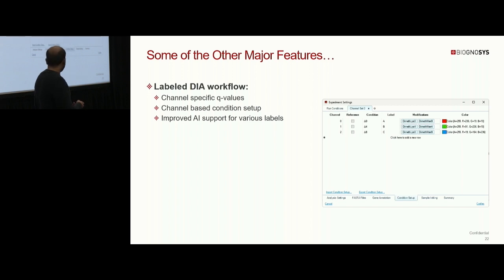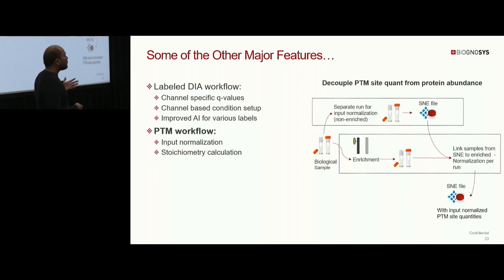And then we also, one of the strengths of direct DIA is the PTM analysis, because direct DIA is rooted in spectrum-centric analysis, so it doesn't suffer from the same issues that you have with very large search spaces as with peptide-centric searches.